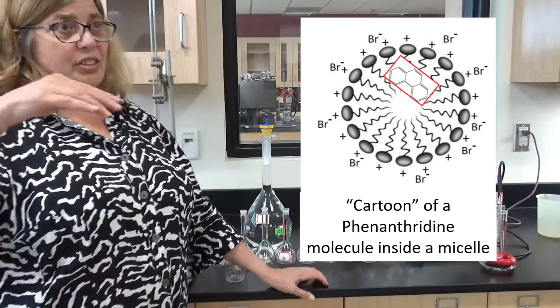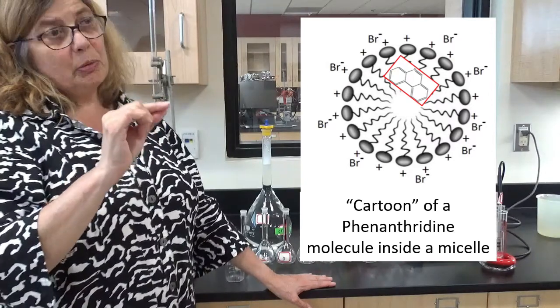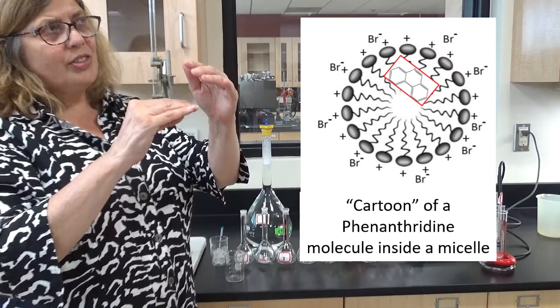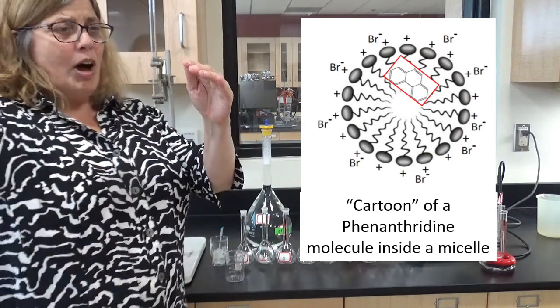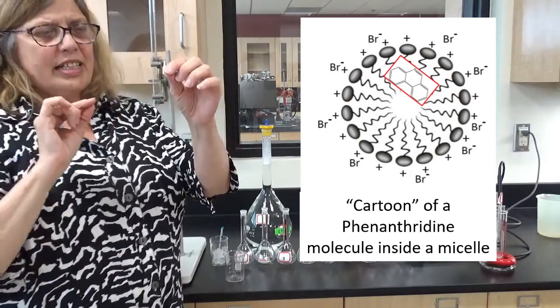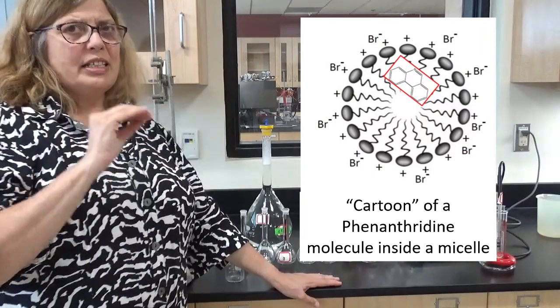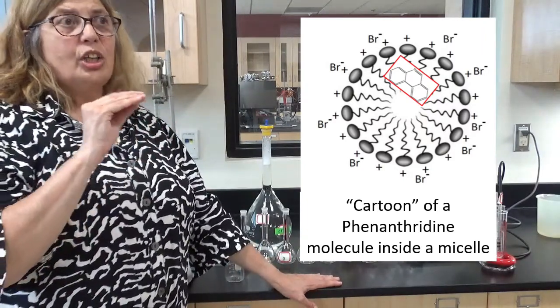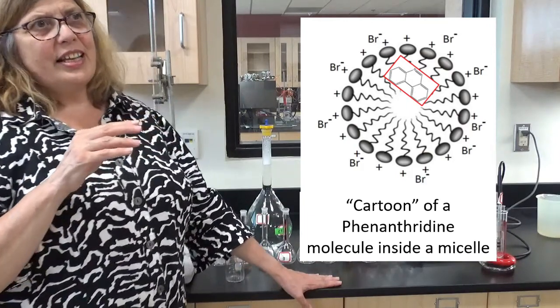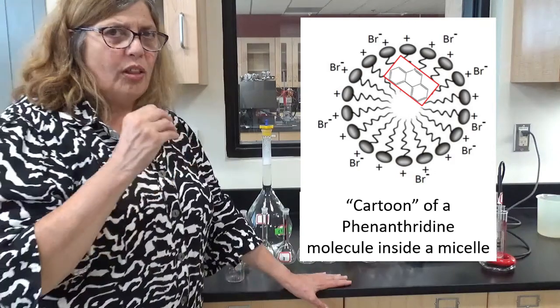So phenanthridine actually goes inside the micelle and locates itself, it's believed, near where the heads are, and bromide ions are associated with those micelles, and bromide ions influence the fluorescence of phenanthridine. So when the phenanthridine goes into the micelle, it actually gets closer to bromide ions. And what those bromide ions do is they decrease the fluorescence intensity of the phenanthridine. We call them quenchers.